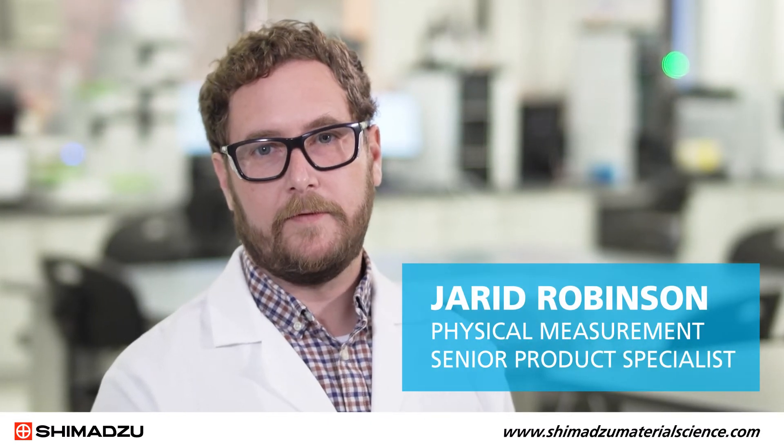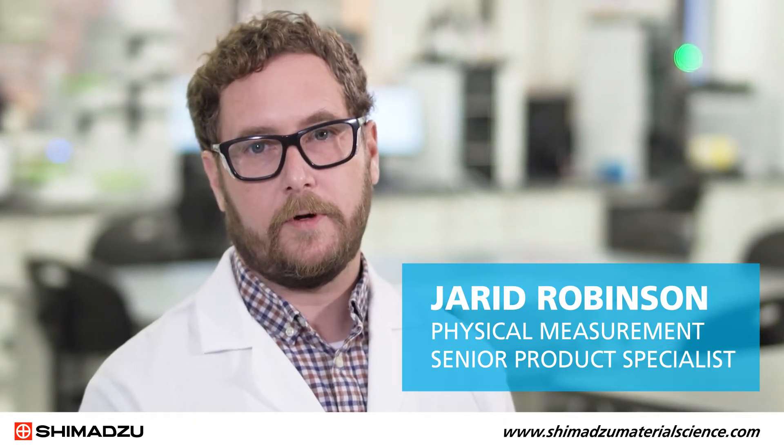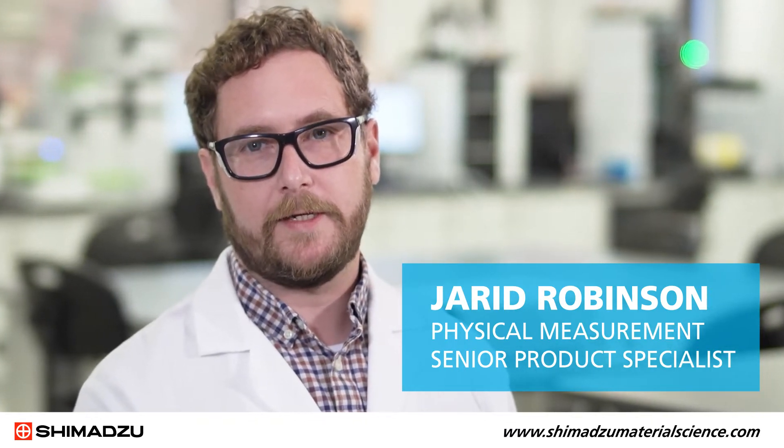Hi, I'm Jared Robinson, Physical Measurement Senior Product Specialist at Shimadzu Scientific Instruments. In this video, we'll go through the startup procedure on the hydraulic power unit on the servo-pulsor fatigue testing instrument.